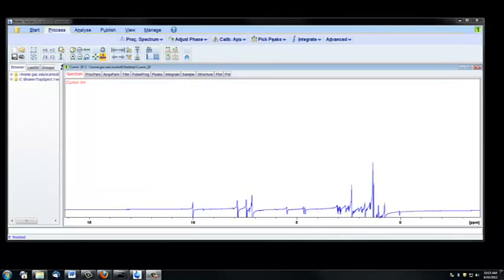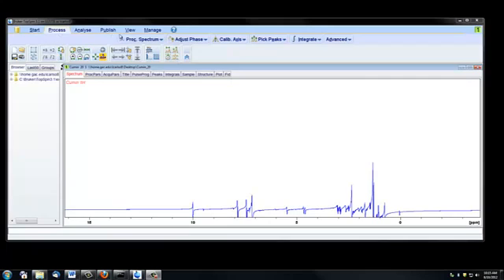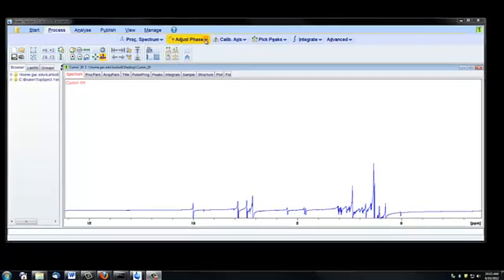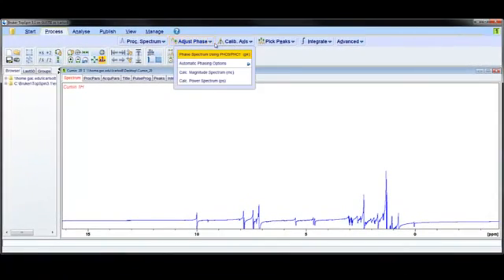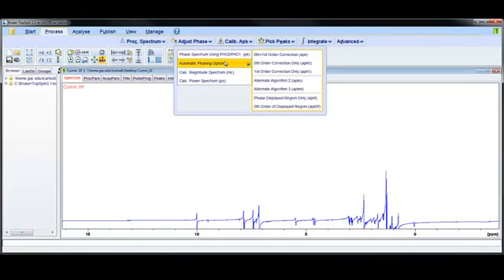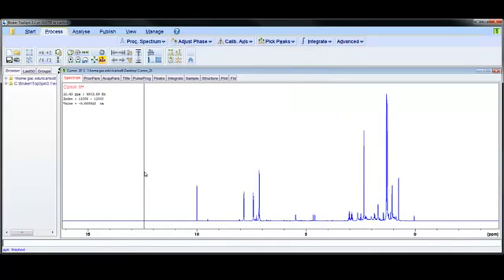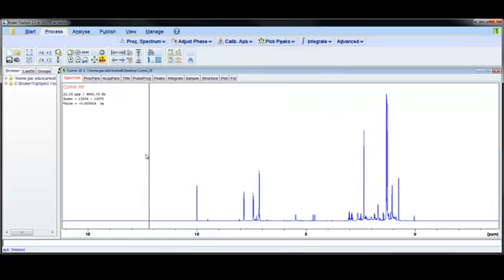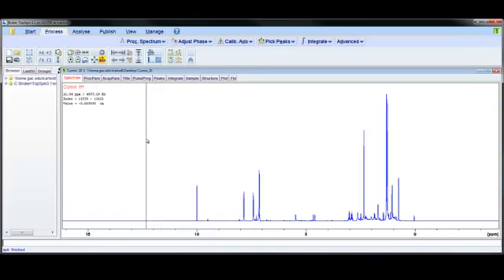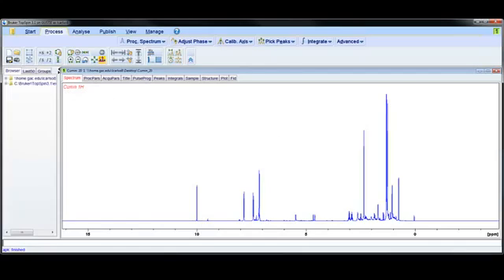And the last thing that happens when we click the Process Spectrum tab is an automatic phase adjustment. So if we click on Adjust Phase, this down arrow, and go to Automatic Phasing Options, and choose 0th and First Order Correction, this is the automatic phasing of our spectrum. And it looks pretty good in this case, but there will also be some times when the phasing doesn't work well automatically and you'll need to manually adjust the phasing of your spectrum. Manual phasing will be demonstrated in another video.